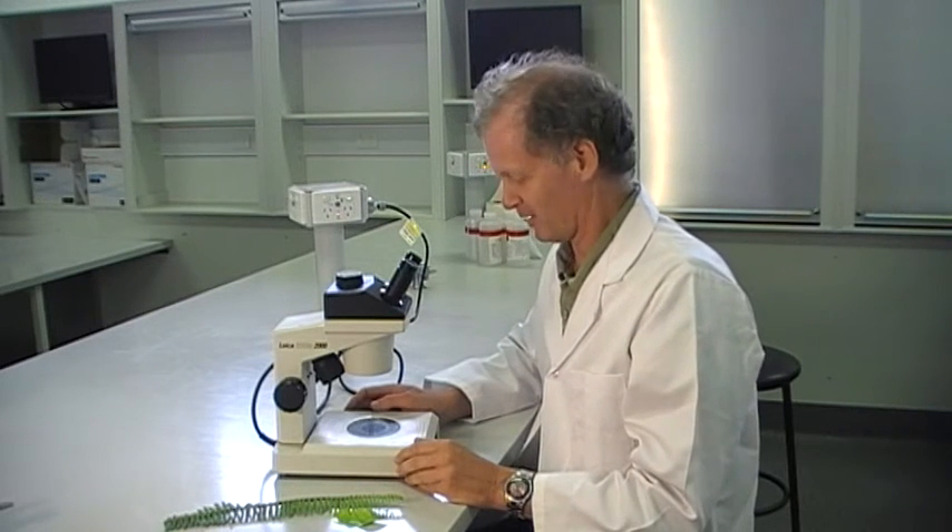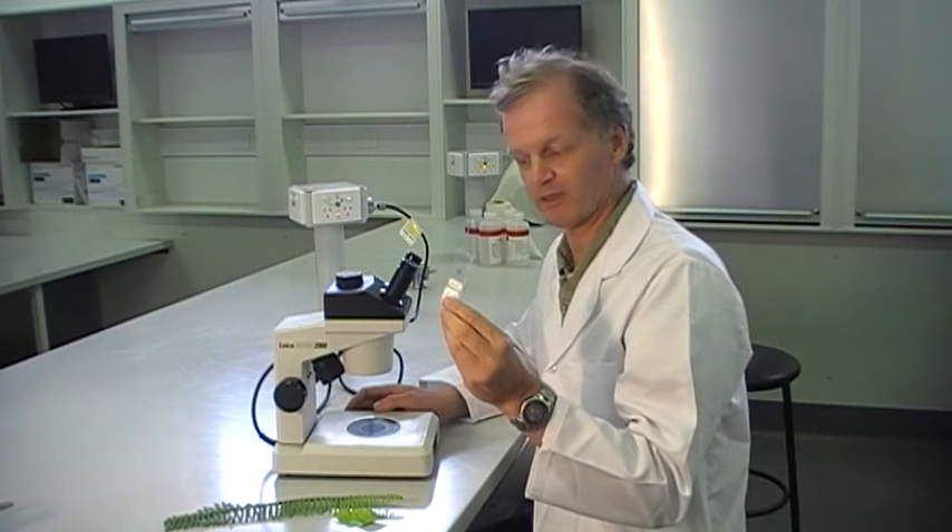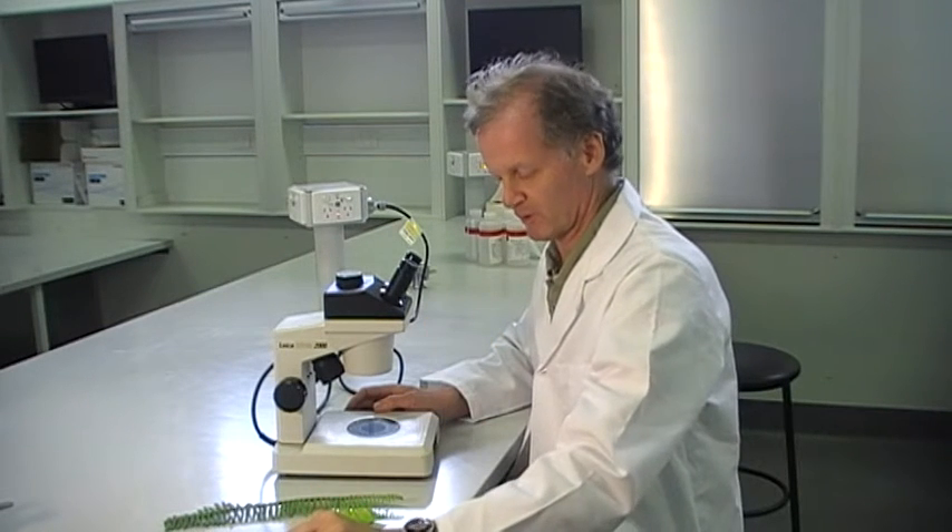What I'm going to do now is show you the ins and outs of the stereo or dissecting microscope. John's shown you the compound microscope looking at prepared slides, and what we use the dissecting microscope for is things like looking at leaves or flower dissections and things like that.